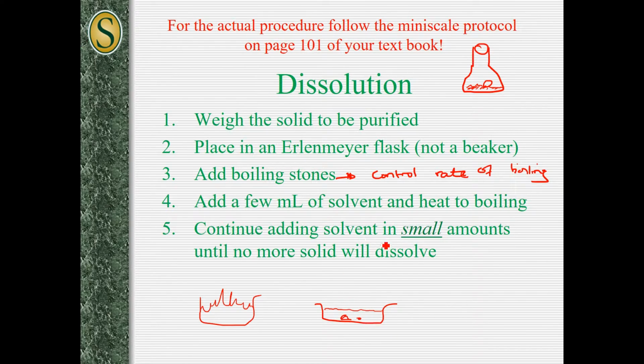the container. Okay, so that's why you need boiling stones, for safety, to help even heating of the liquid and control the rate of bumping of the drops or the bubbles out of the container used to heat the liquid.